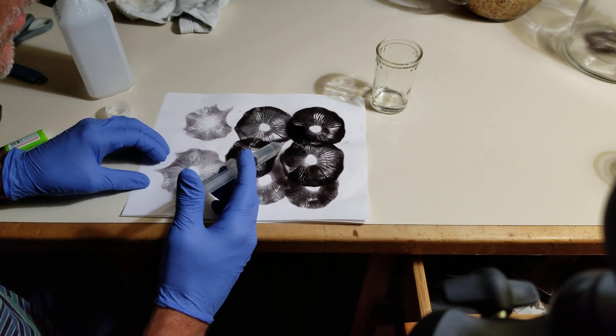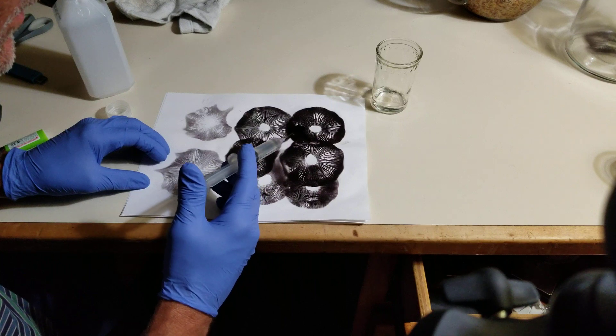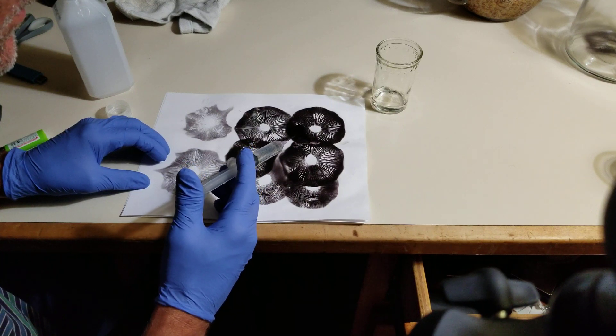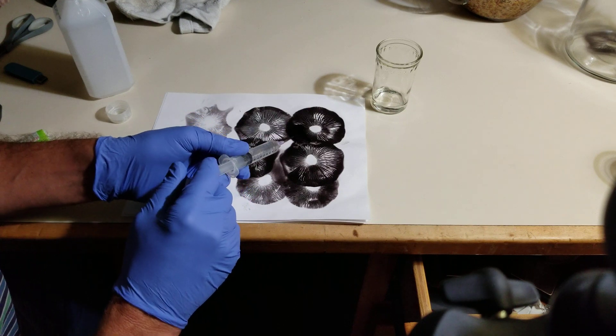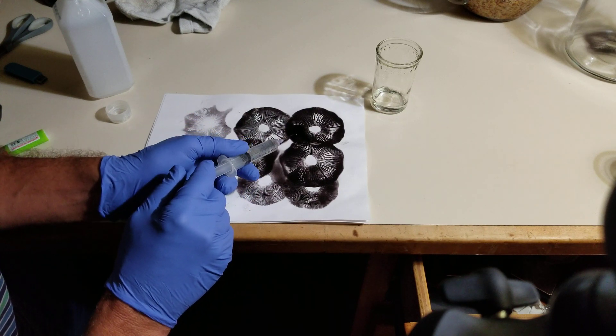Now a lot of this is removed. All of these spores are in that water. That's what we're going to pull up.